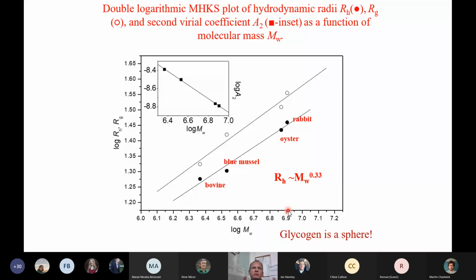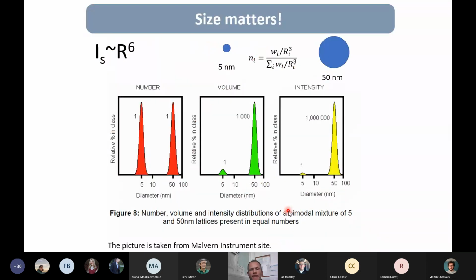Again, to make such an analysis, you must have a series of similar objects with a broad range of molecular weights, right? Most probably you are not so lucky. So, well, I guess you have to make some kind of microscopy experiments to get an idea about the shape and maybe the internal structure of nanoparticles.